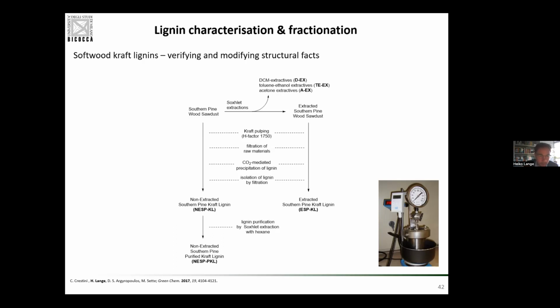What type of process did it see? Maybe I do not have that information anymore. If there are lots of suppliers providing lignins with no name, with not a clear history, maybe a mix of lignins, etc. So being able to develop a fingerprinting type of analysis system for identifying the type of lignin, its history, gives me a better chance to not choose the wrong lignin for my intended application.